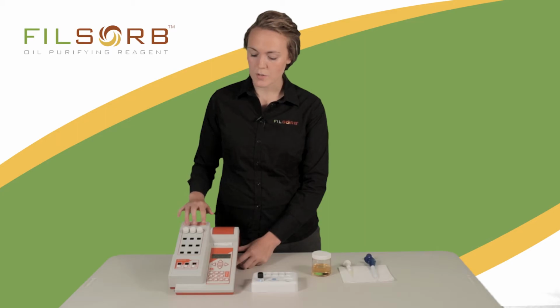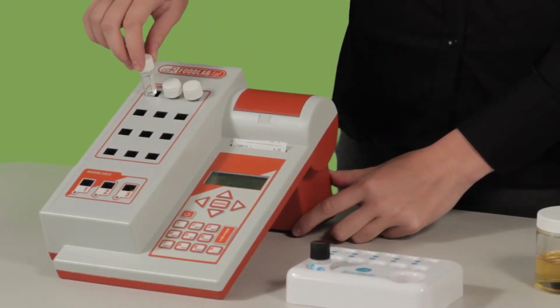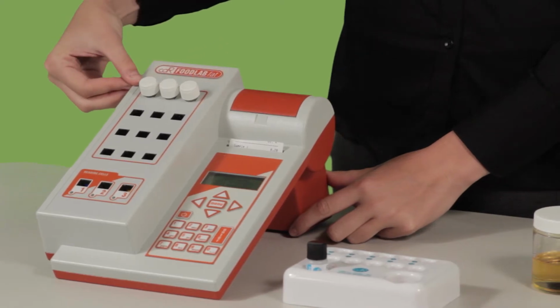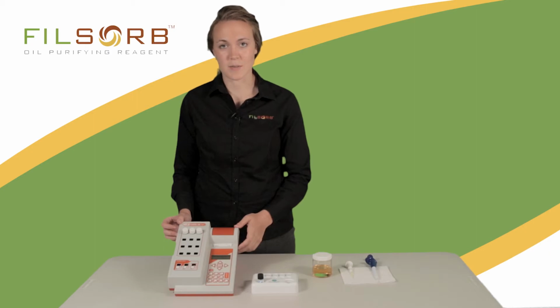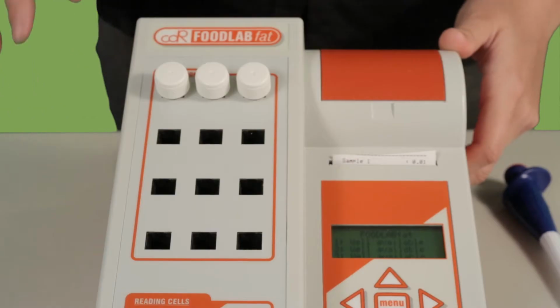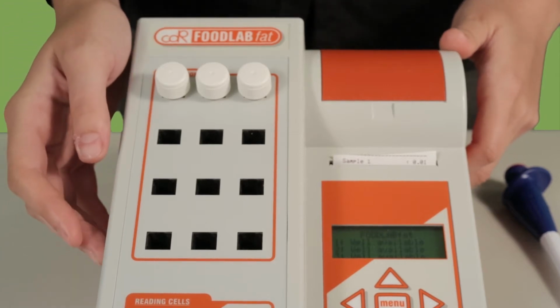First, you will need to incubate your reagents within your cuvettes for 5 minutes in the incubation cells. Once you've let your cuvettes incubate for 5 minutes, you are ready to test for peroxide or PV value. For our purpose, we have only incubated 3 cuvettes. You have the option for 12.